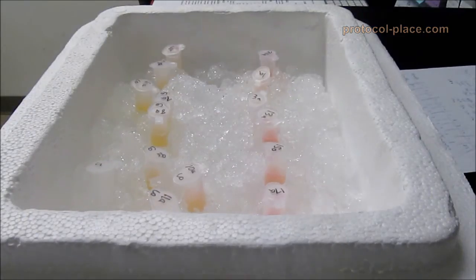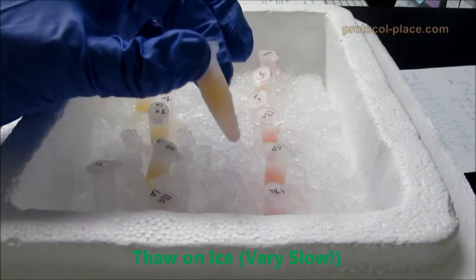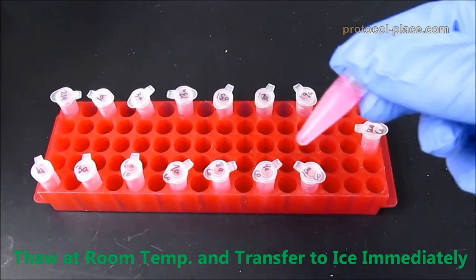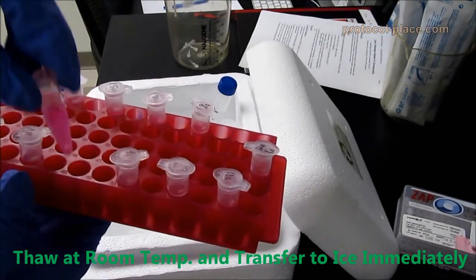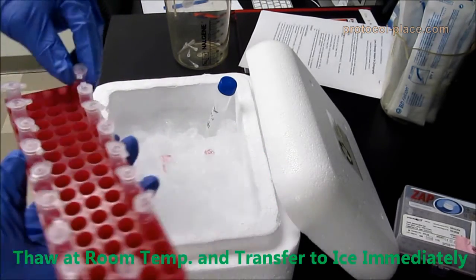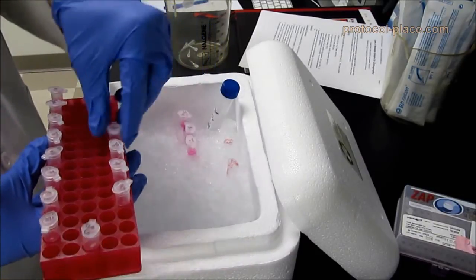When thawing samples that have been stored at negative 80 degrees Celsius, you can either leave them on ice for several hours to melt, or you can thaw them at room temperature and then place them on ice immediately. Just keep checking the tubes every 5 minutes and return them to ice once the media has almost completely thawed out. Try not to let them sit at room temperature for more than they need to be.